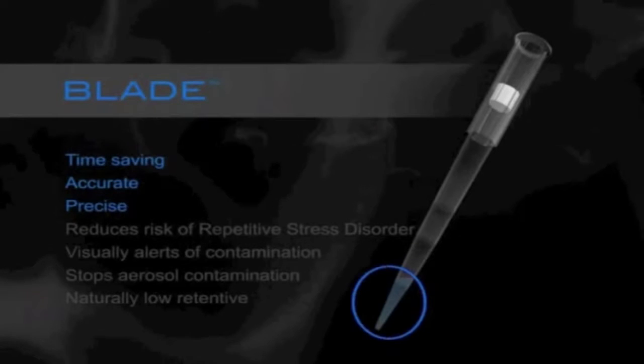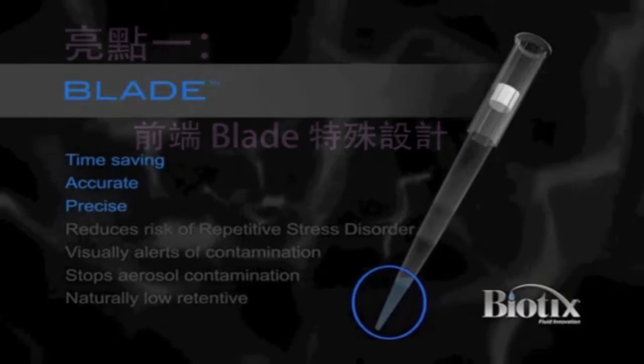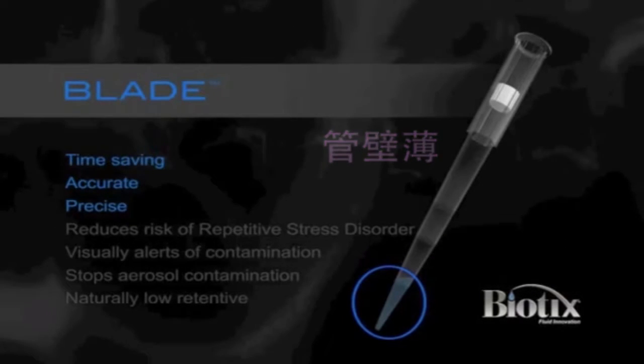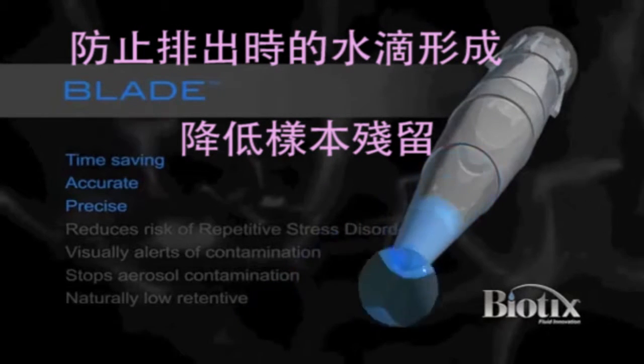Based on a mathematical ratio between the pipette tip wall thickness and the distal end orifice, Blade also takes into account the surface area needed for a droplet to cling to the distal end of the tip, eliminating the need for tip touch-off.